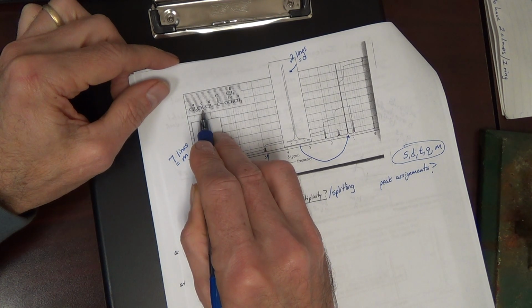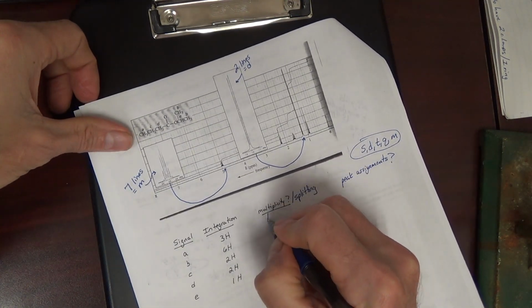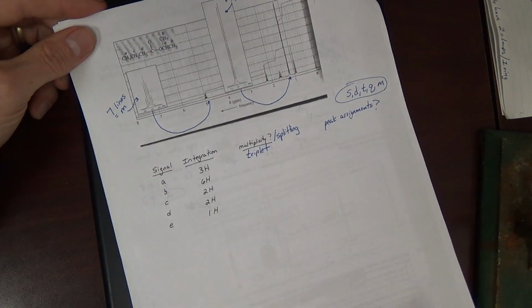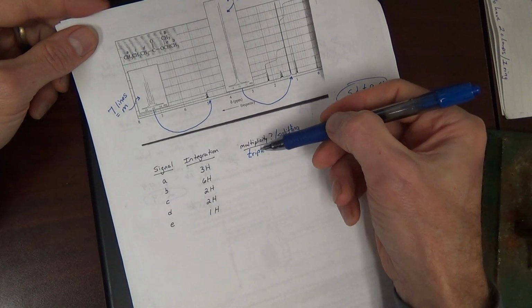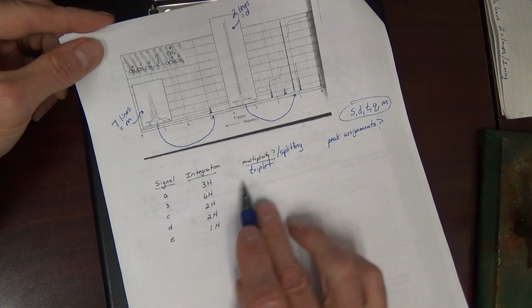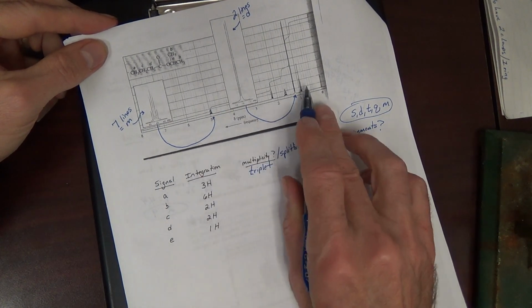Two neighbors. N plus 1 would be 3. A would be a triplet. So, you can work towards filling the rest of these in and also identifying where this triplet is in the spectrum.